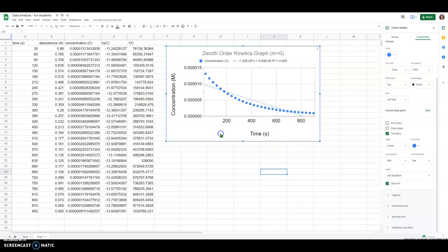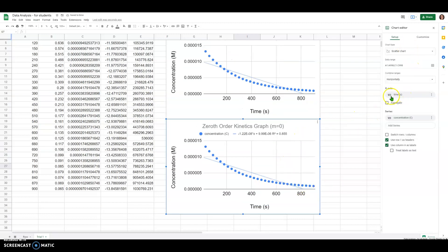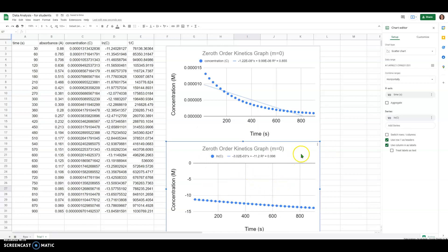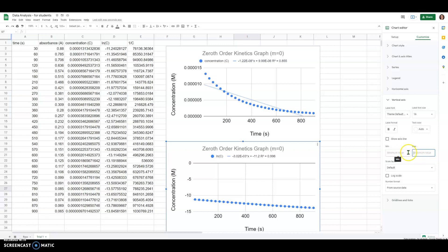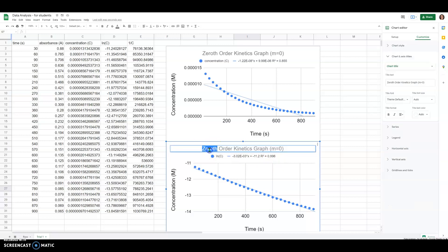Once you've got one graph set up, here's a shortcut: copy this graph using Copy Chart, then paste it. All your formatting stays the same. Double-click the pasted chart, go into Setup, and change the series to the different Y values for the next graph. For the second graph, change the Y values to the natural log column — that's column D. Change the C's in the series to D's and hit OK. For the natural log graph, adjust the vertical axis maximum to something like negative 11 so the data fills the whole graph. The trendline, equation, and R-squared are still there.